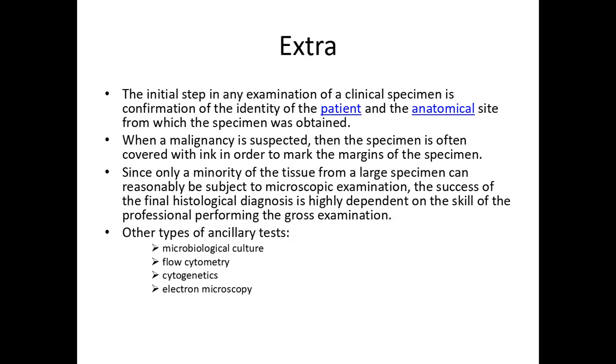The success of final histological diagnosis is highly dependent on the skill of the professional performing the gross examination. If the person performing the gross examination is not really that good, the chances are that person will miss the important part of the specimen.